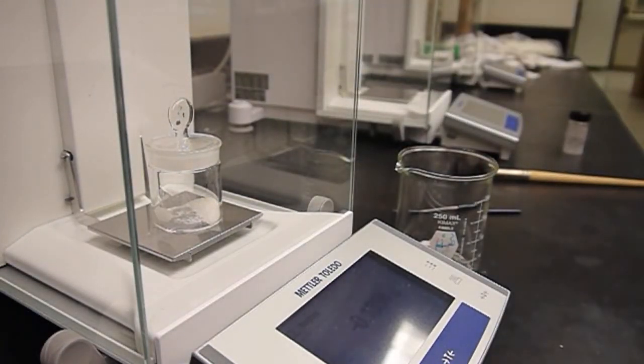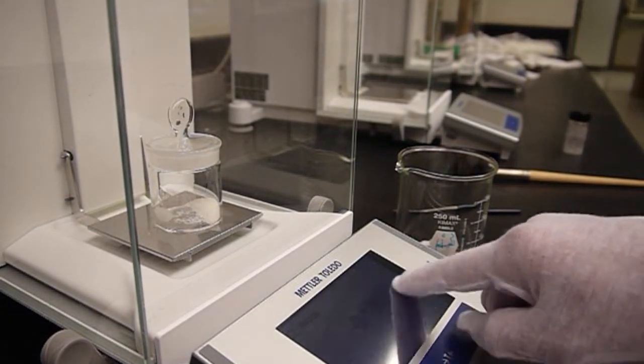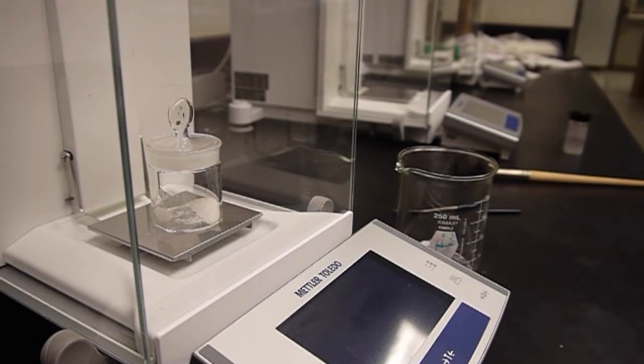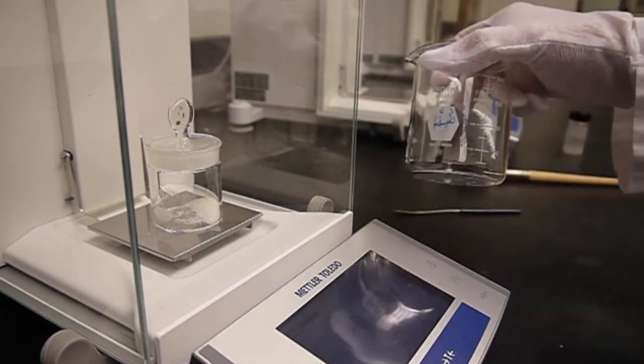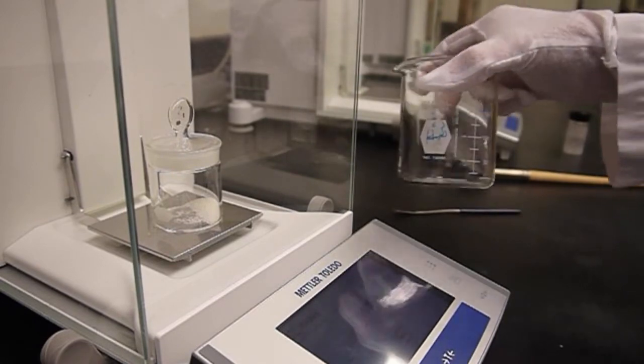Now I've removed mass. I'm getting a negative value on the balance, which is great because this number I'm reading here tells me the mass that I've transferred into the beaker. This is the mass I'm going to dissolve in water and use during the titration.